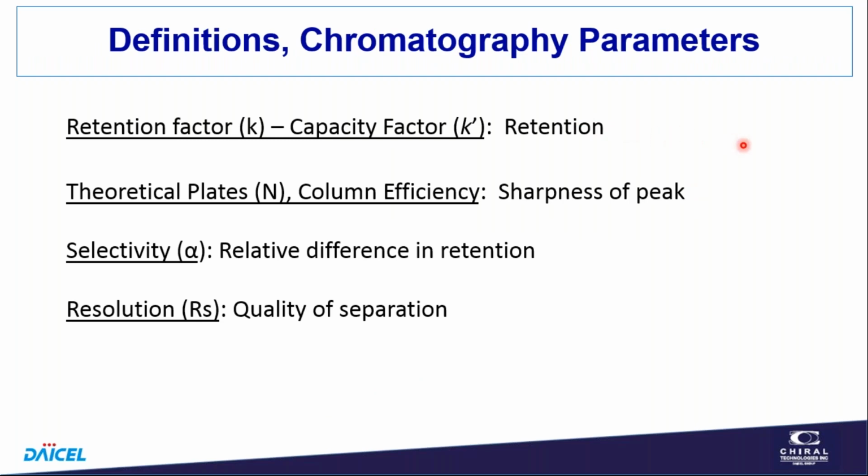What I would do is I would refer you to fundamental textbooks in chromatography. Even gas chromatography discusses these things in ways that generally are applicable to liquid chromatography. Some of the specifics are different, but we're still dealing with the partitioning between a stationary phase and a mobile phase, and these are equations to describe that behavior.